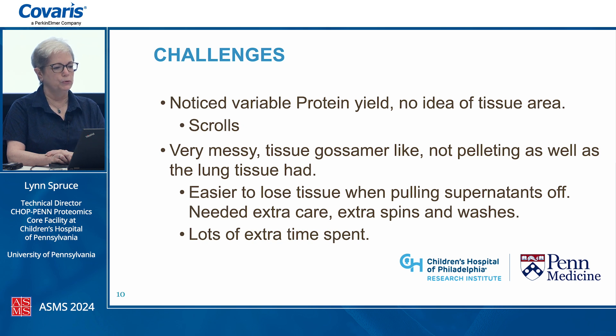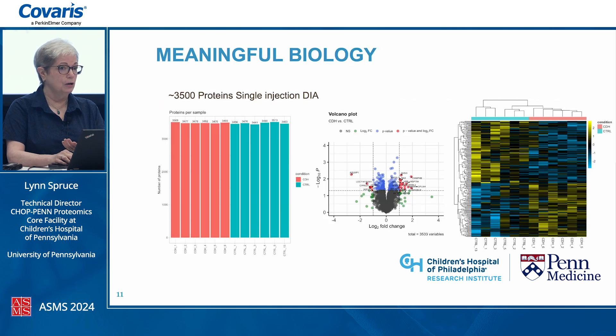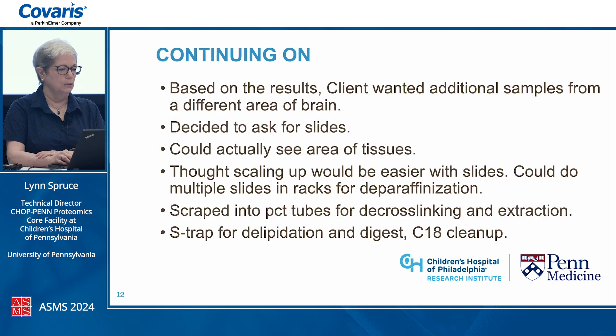We noticed variable protein yield from the protein assay. One thought was that we were dealing with scrolls and our client wasn't forthcoming about tissue area, so we had different tissue amounts. Also, the brain tissue was very gossamer-like and did not pellet well like lung tissue after processing, adding a lot of extra time — we had to take care not to remove tissue during rehydration steps, requiring extra spins and washes. But we got meaningful biology out of it: we got 3,500 proteins in a single DIA shot, and the client was thrilled.